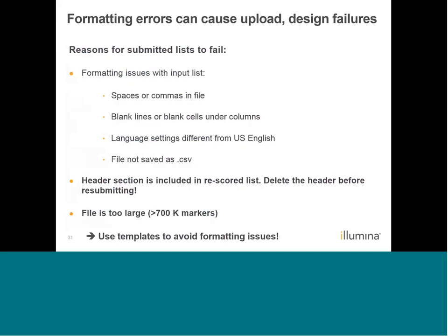So it is possible that you can experience some errors when you're uploading these input files. Some of the reasons have to do with just simply the formatting of the CSV file, and those of you who've used a sample sheet to create a project in Genome Studio may have experienced some of these formatting issues, such as spaces or commas in the file, or blank lines or blank cells under the column. The easiest way to determine whether you have these kinds of issues is to open your CSV file in Notepad and take a look at it.